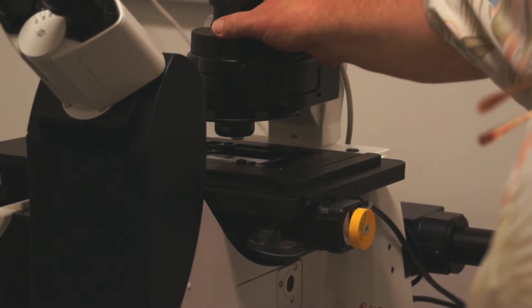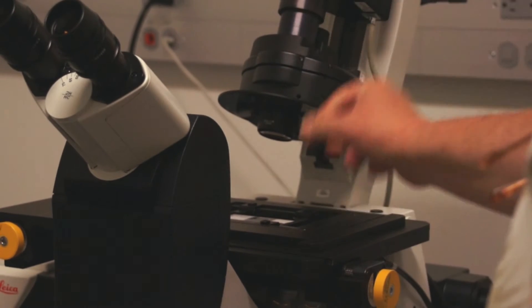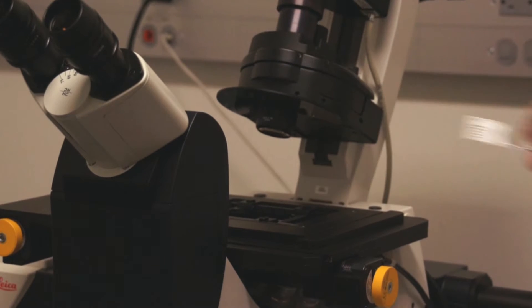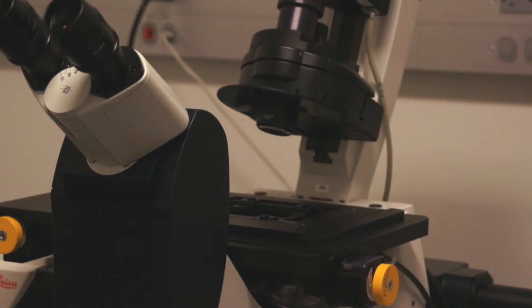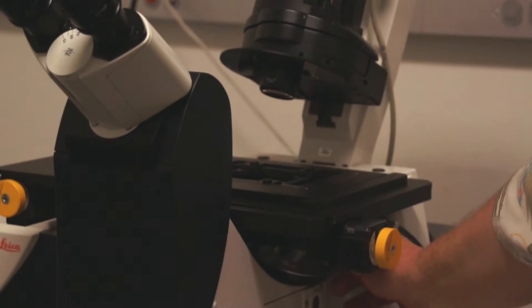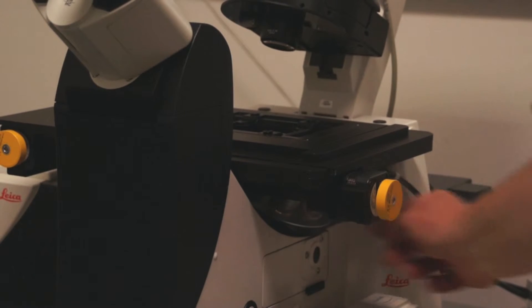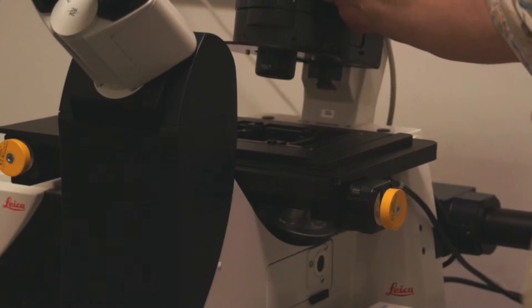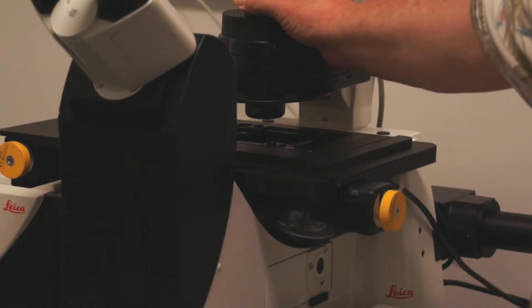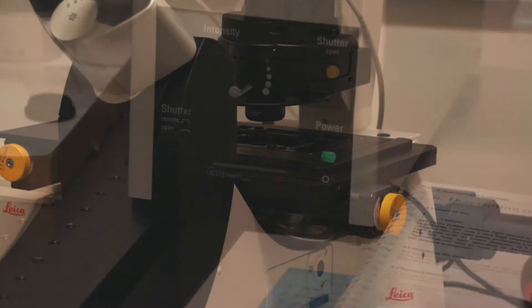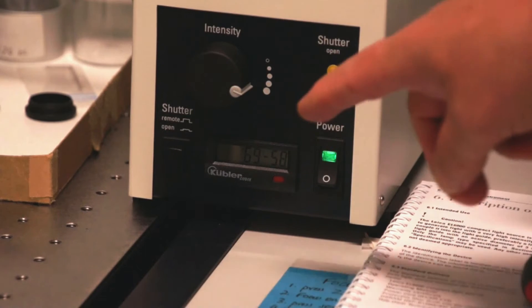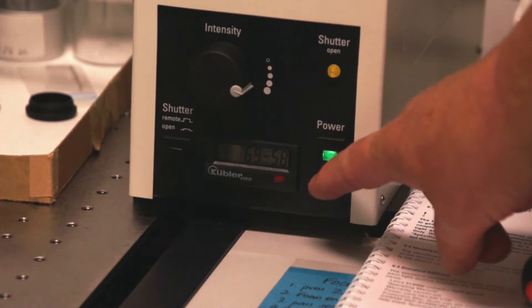We rock our illuminator out of the way, we take our slide off the stage, we dial our objective back down to the empty space, bring our illuminator back into place, and now we're ready to shut down the power buttons. Do not forget to turn the power off on the reflected light epi illuminator for the microscope.